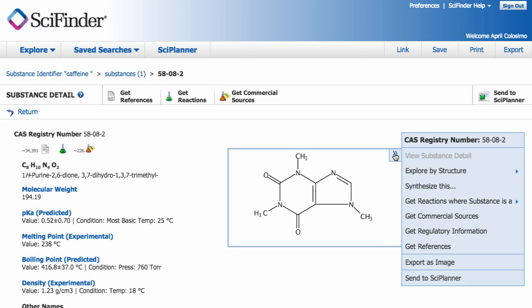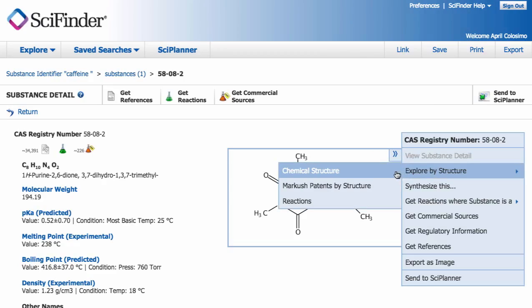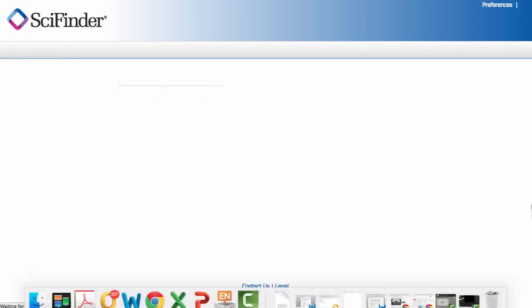Back to SciFinder. I am now going to select Explore by Structure, Chemical Structure, and that is going to send caffeine over to the SciFinder structure editor.